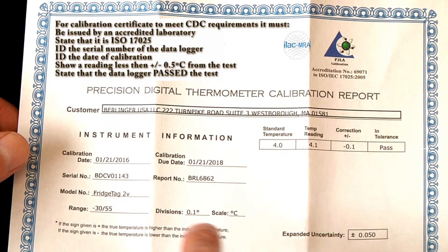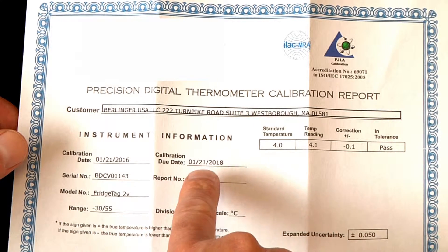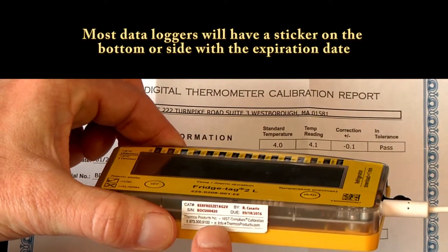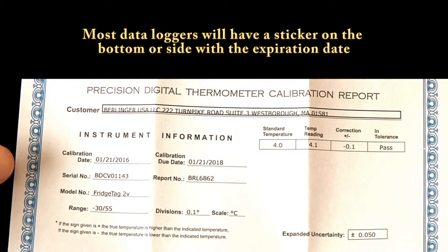It's important to also note the calibration due date or expiry date — in this case it's January 21st, 2018. Most data loggers will also have a sticker on the bottom or the side reminding you of when it expires. That's an important date to replace your data logger.